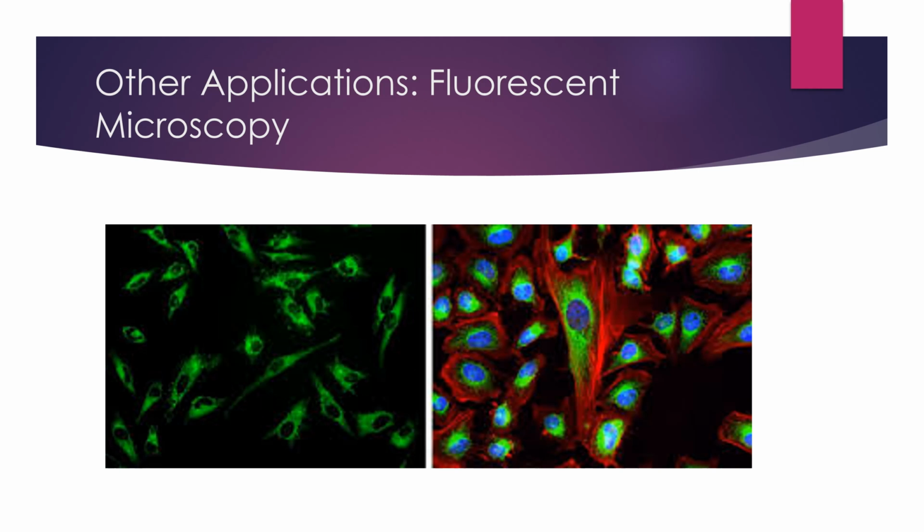Now, as engineers, we are going to come into contact with other majors, other disciplines. Especially in materials, one area where we might use something called fluorescent microscopy is in biomaterials. If we look here, these are called HeLa cells. HeLa, H-E-L-A, is short for Henrietta Lacks. She was a woman who had cervical cancer, and her cells wouldn't die, so they were able to be studied for an extensive amount of time and replicate. We're still using her cells today, and they're the most well-researched cells used for cell passaging, cell culture, and many different research techniques.